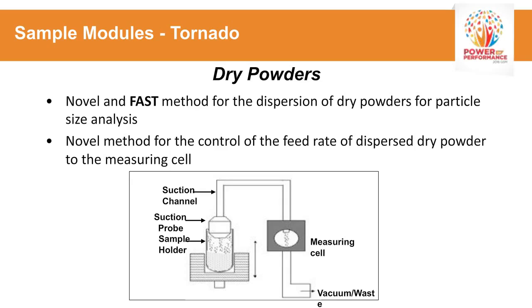This is a laminar flow cell that keeps the particles in a nice tight stream, so you don't have a lot of spray.